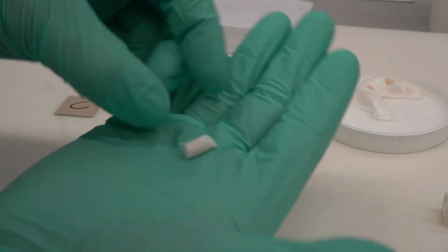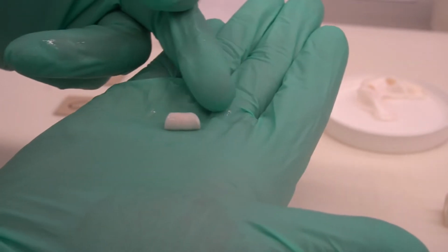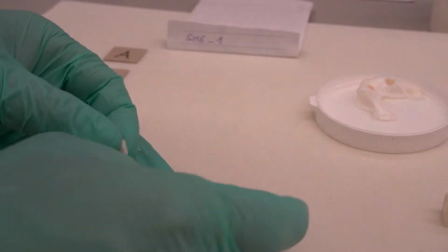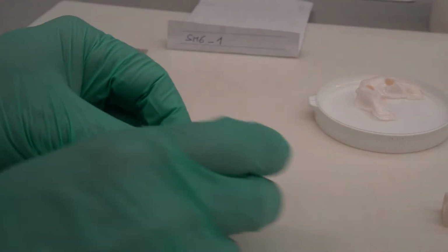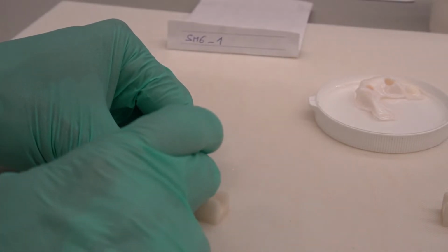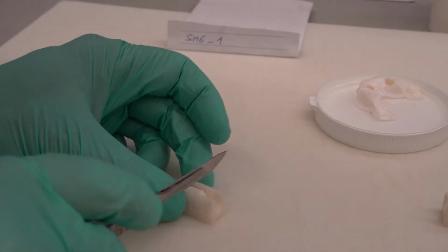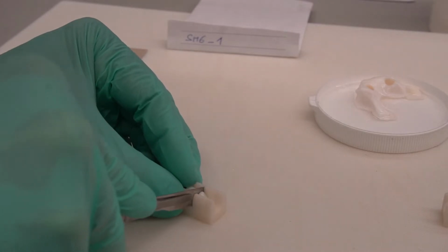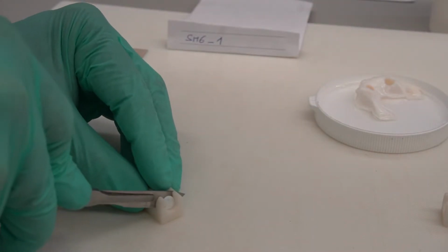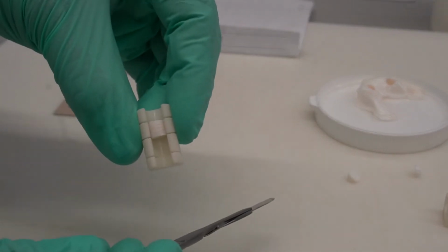Okay. I'm planning to do compression tests, but this is not possible with this shape. As you see, the bottom and top surface is inclined, so it's not a perfect cylinder. What I made for cutting is this cutting guide. It has slots here at a certain distance, so this is 6 millimeters. I will cut the sample now. I have a perfect cylinder.